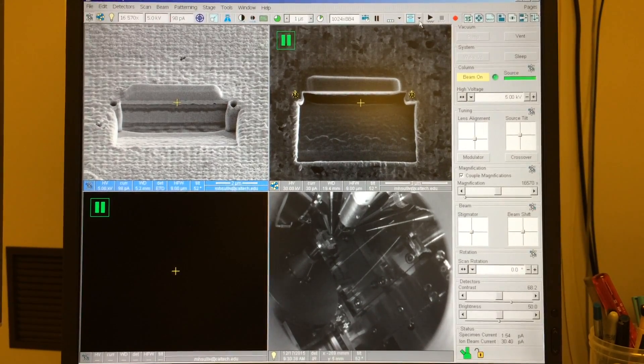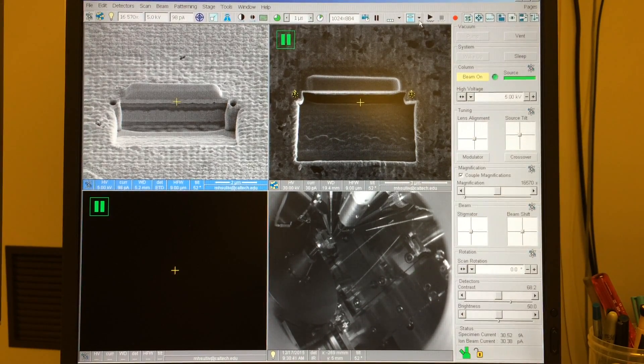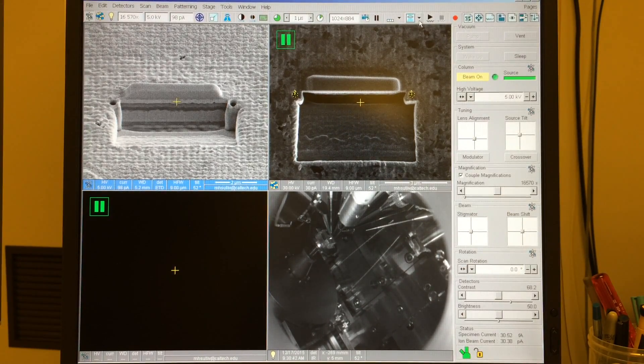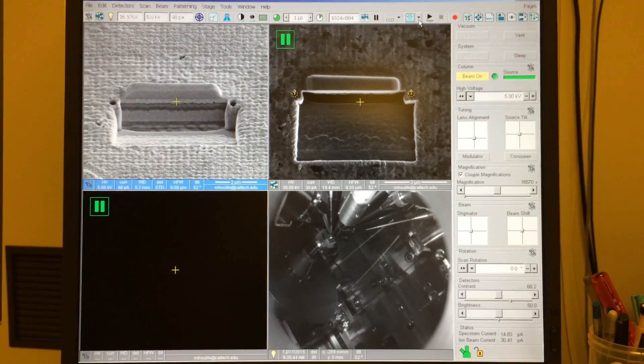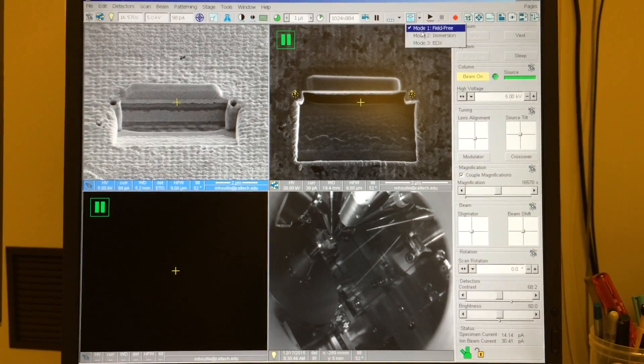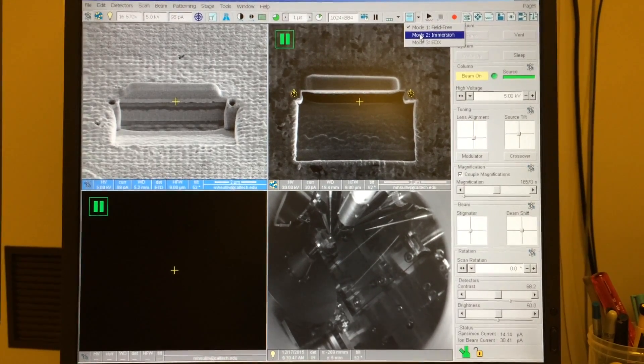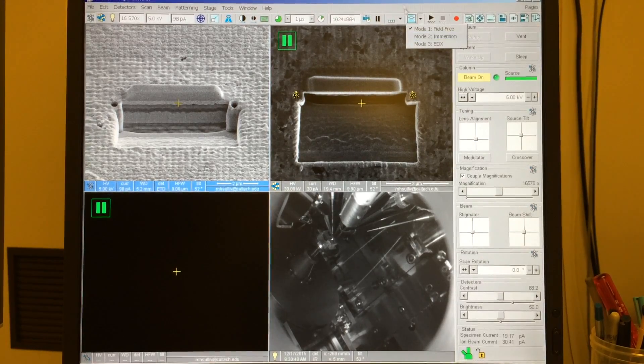In the next three videos, I'll demonstrate how to get a high-resolution image of a cross-section surface. In this first video, I'll show how to get a first approximation alignment in immersion mode, also known as ultra-high resolution mode.